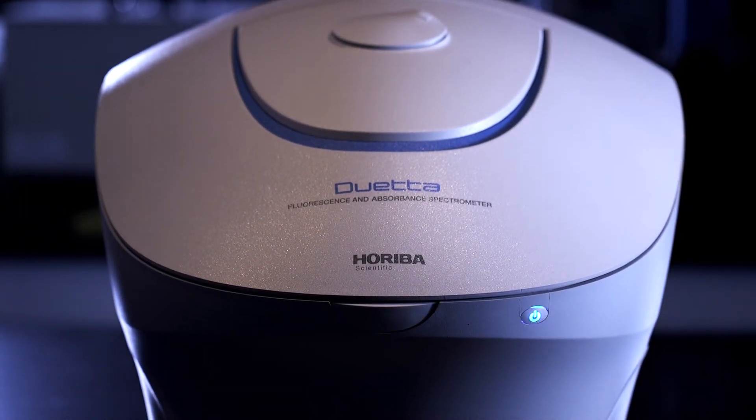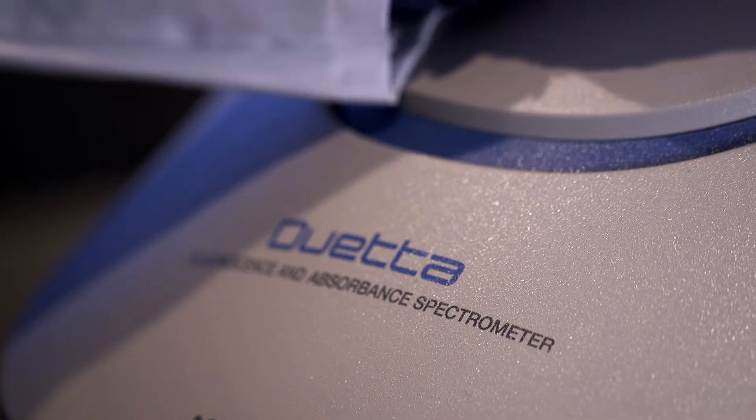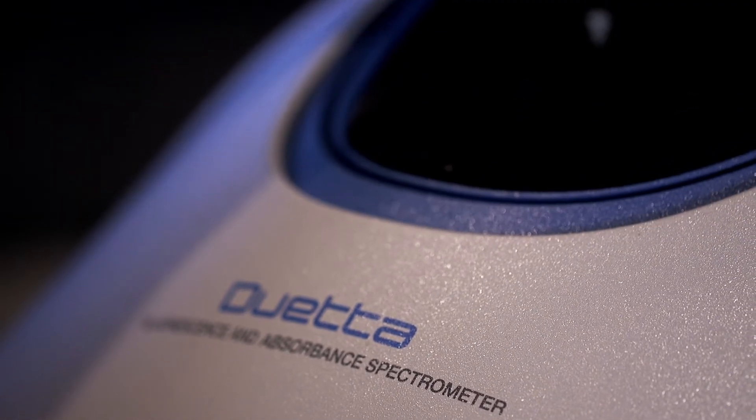This is our new spectrometer. It's called Duetta. It's a fluorescence and absorbance spectrometer that captures fluorescence in the blink of an eye.